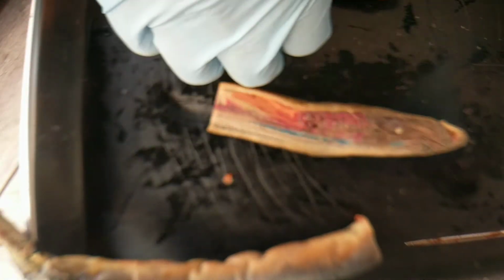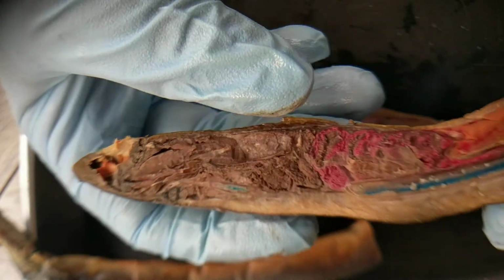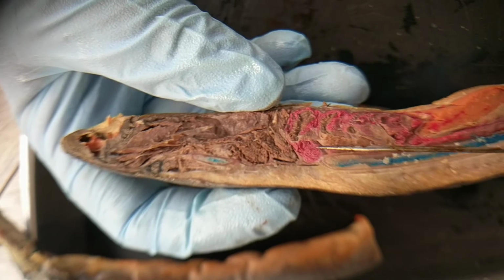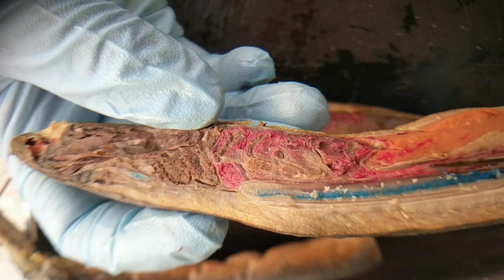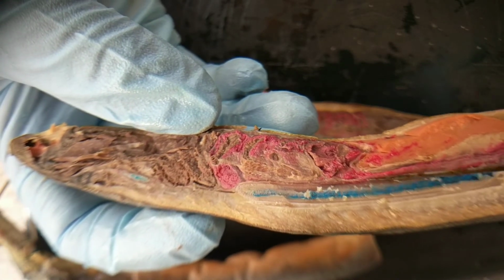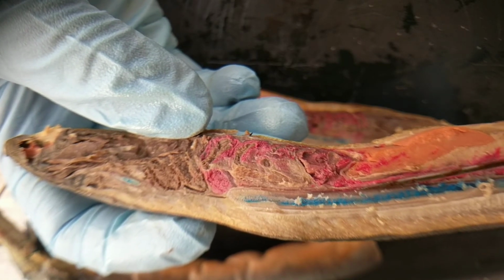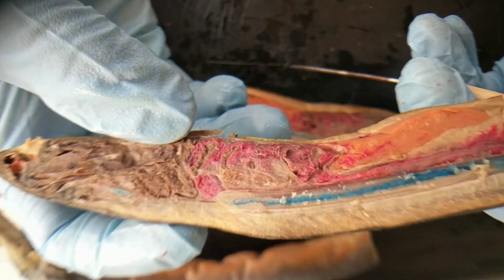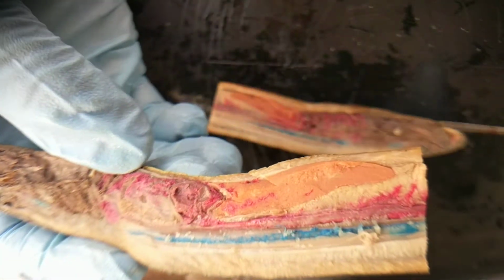Actually, this side, this section shows the heart better. Let's see if we can get the light on here. So here's the heart. And here's the aorta, and then the blue is the vein. So there are major circulatory blood vessels below the notochord. We're going to learn about that later in our section on the circulatory system, but I just wanted to show you that here in the lamprey.